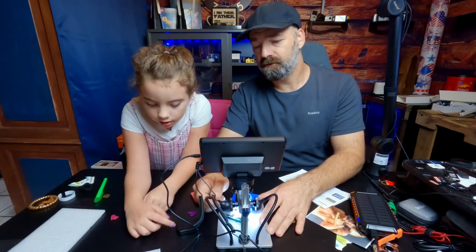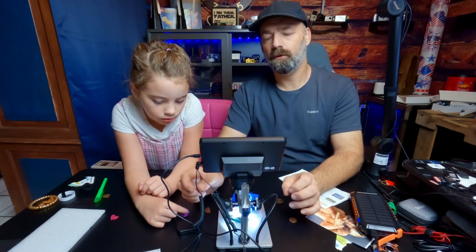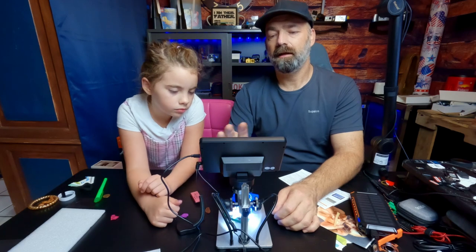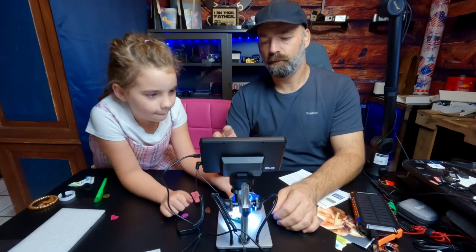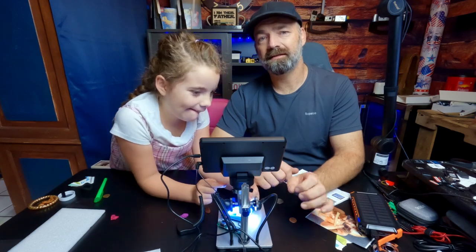When we first started using it we were getting a very grainy image, but that's because we had the lights turned down too low. Turn the lights up bright, it will auto-expose for the brightness level and get rid of that grain, giving you a nice 1080p image. It's extremely fun — Lizzie's having a blast with this thing.